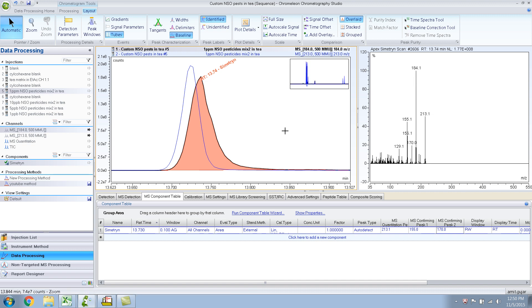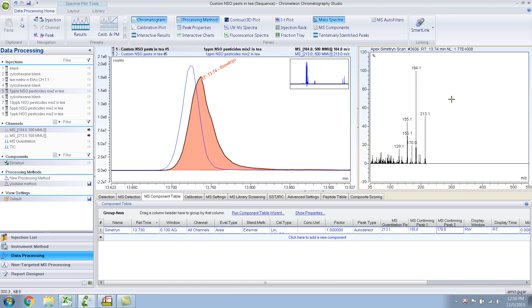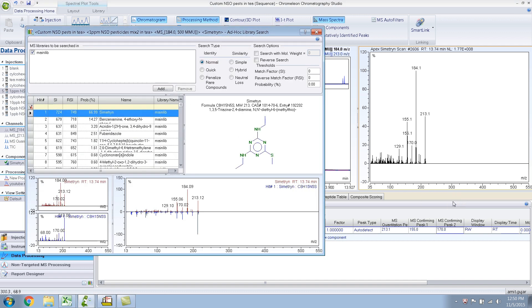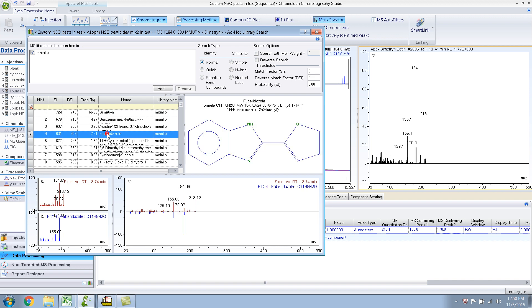So let me do a library search on this particular peak. Right click library search. It still shows symmetry as the primary one. Let's see what this one looks like. Yeah, so you can see the library hit is 184 over here. So I think there's a good chance that this particular pesticide, which is coming off with symmetry.